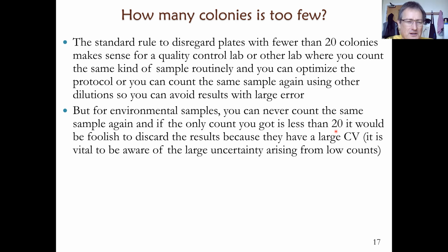So to summarize what I was trying to explain, a single CFU can come from a single viable cell or cluster of many viable cells. And most environmental bacteria in your sample will not form a colony on one particular medium, even if it's not a selective medium. And that's known as the great plate count anomaly. It's a typical idea that the number of cells that grow is 1% or less.